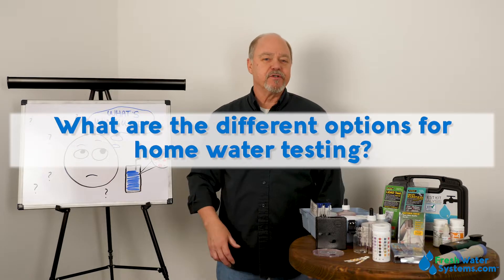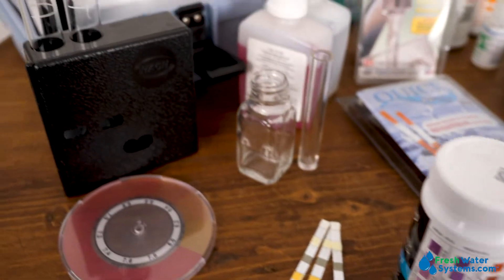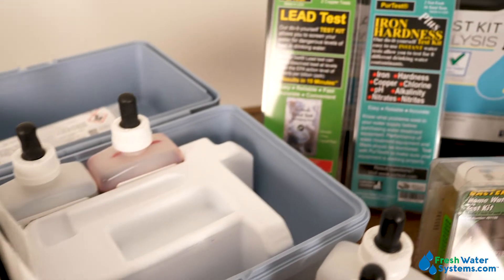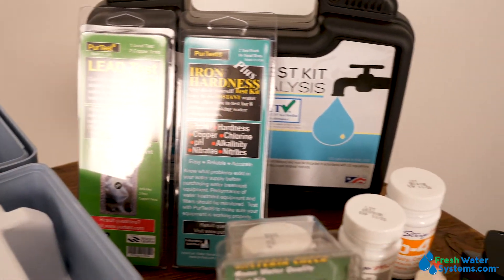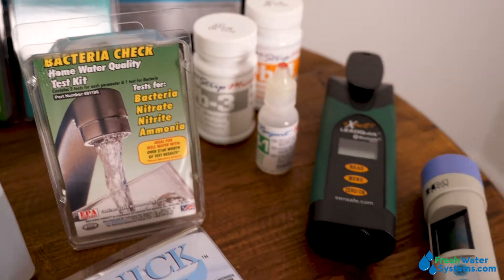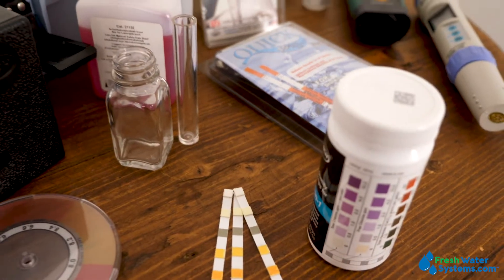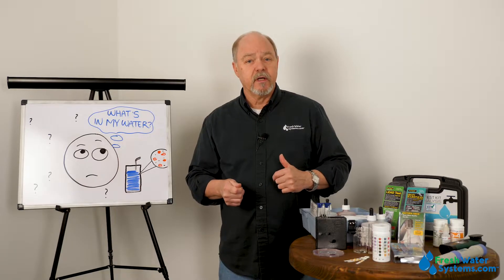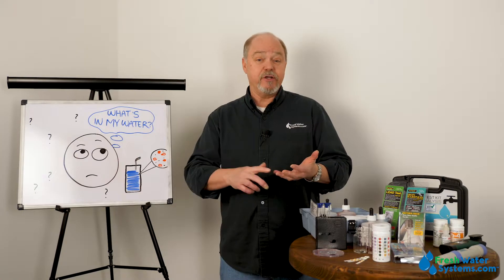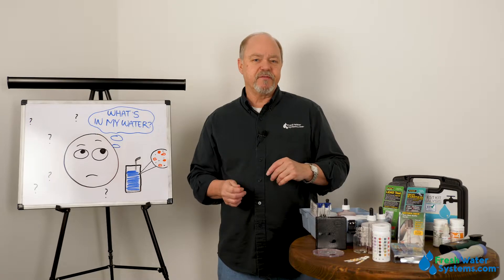What are the options for water testing? There's a variety of options and methods, but a lot of it is fairly specific to what it is we want to find out. For example, if you want to make sure that your water softener is working, a water hardness test strip would be ideal — you just dip it into water periodically. If you're concerned about contaminants like nitrates or arsenic, then that's going to require a little more specific type of testing.